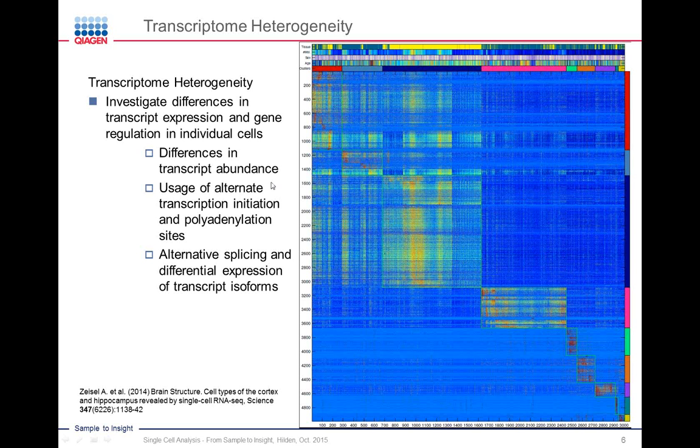And you can see that there's different groups of, in this case it was neurons and neuronal cells, and you can find new classes of, I believe, oligodendrocyte in this case, based on their transcription profile. So you have cells that are in the same tissue that may look, from a very microscopic level, the same, but they have very different functions.